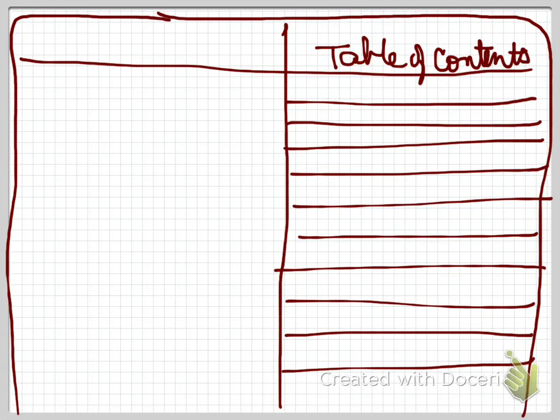Okay, we're going to start recording the lab notebooks, how you do them. Hopefully you'll have an example to go by. I've also given you the handouts. Ms. Hawkins should have given you those by now. But I have for you, I've drawn my notebook drawing. Here's the table of contents.